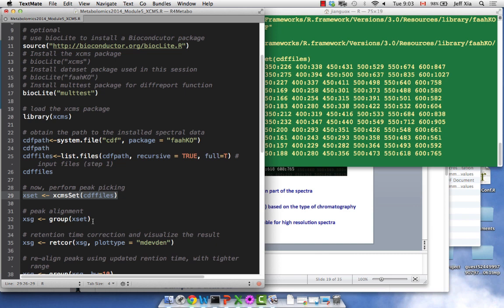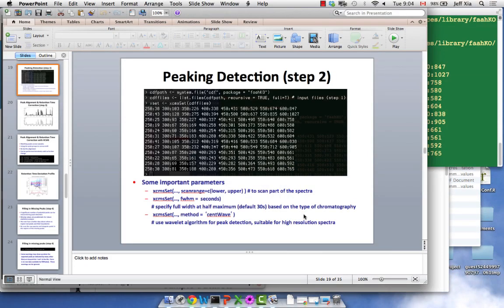Did you load library XCMS? It's a warning. The MZ warning can be ignored. I tested it, it's fine. But I guess in the next two weeks it will synchronize. It's just that we use the most recent R. That's usually where you get such a problem.